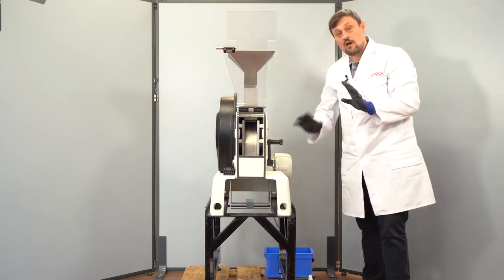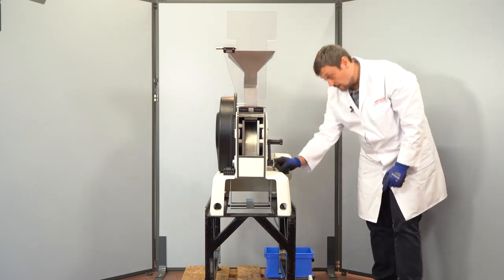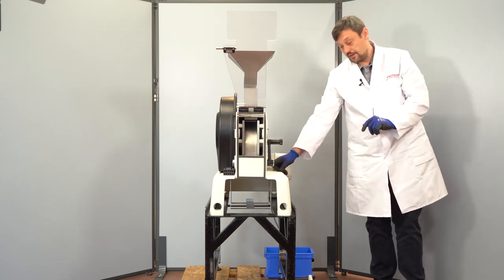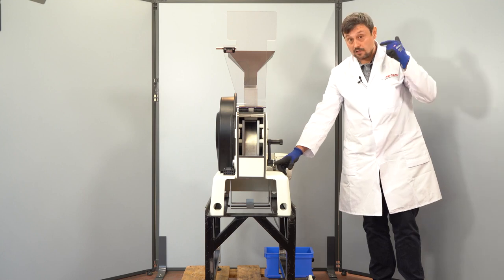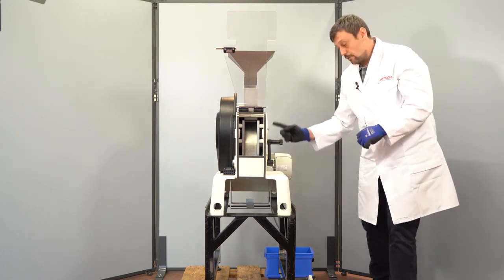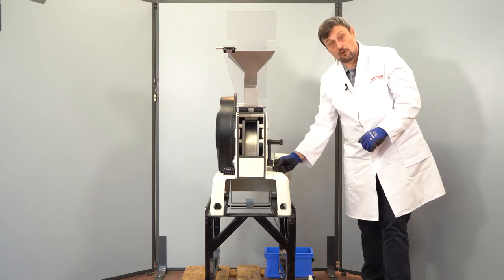Please note, after the job is done, that you will position the holder in here correctly, because as you hear from the sound, this clicking noise confirms the position of the holder in here.